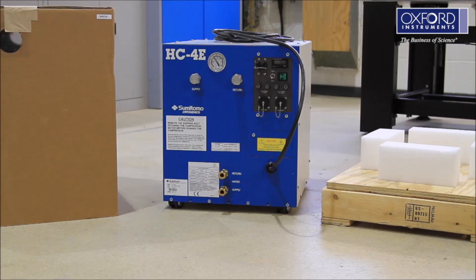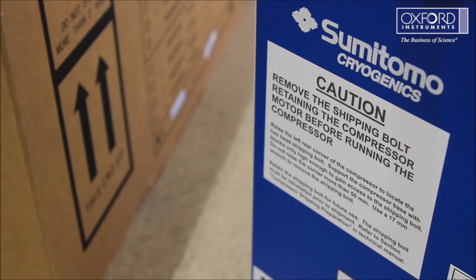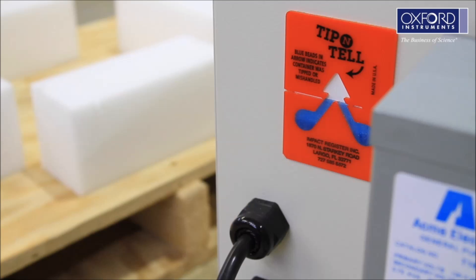Remove the compressor from its packaging. Check the static pressure to ensure it has not lost any helium gas. Remove the shipping bolt as described in the manual. Check the Tip-N-Tell indicators fitted to the compressor. If any of these have been activated, please let us know.